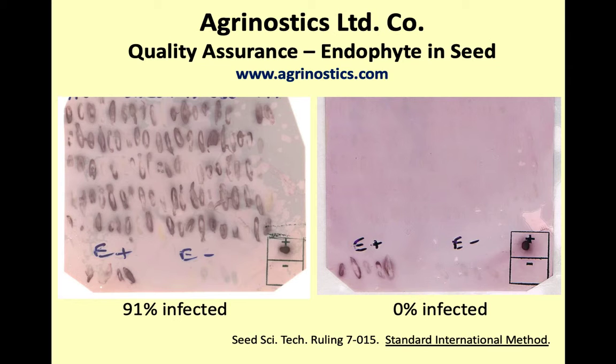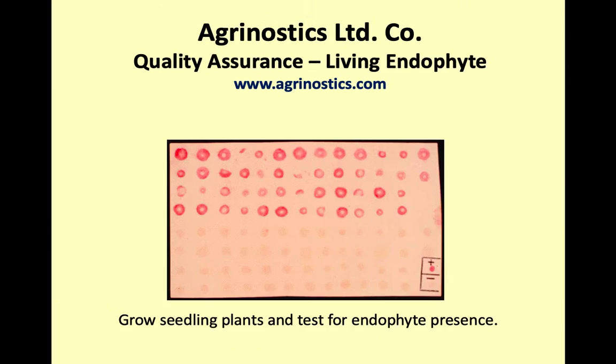So this is in seed. Here's what it looks like when we're testing stem tissue. Remember I told you that the endophyte is going to grow into a developing tiller? That's how we test for viability. Just because the endophyte is in the seed does not necessarily mean that it's viable.